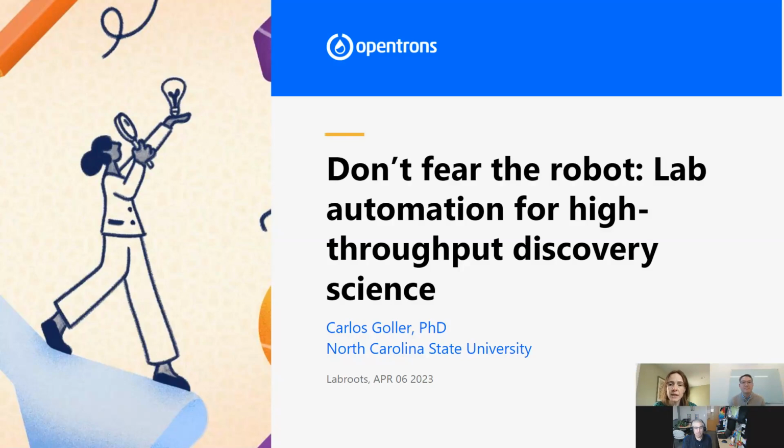Okay, so we have a couple of OT2 specific questions, which I could probably answer. So the first one is, what level of programming do I need to know to operate an OT2? So a little or a lot, I think, is the answer there. And I will also get Carlos and Greg to weigh in, knowing that they obviously have worked extensively with an OT2. But fundamentally, we offer 4 different ways to get your protocol done.